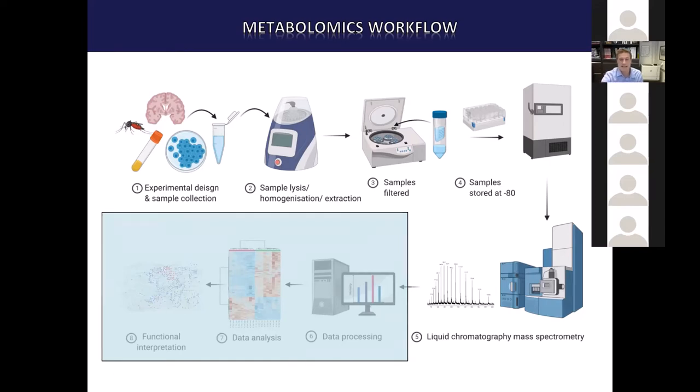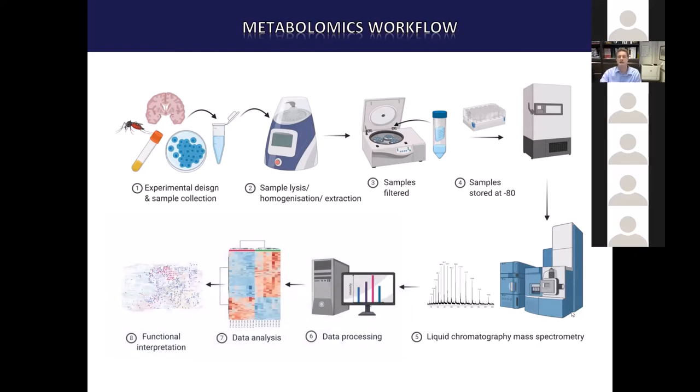What we need to do next then is, of course, the last part. And that is to say, how can we take that data set and both process and analyze that data in such a way that we can then interpret what's happening in biology? And that's obviously in some ways the most important part of what we're doing.